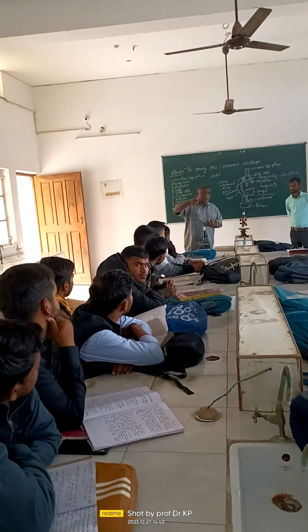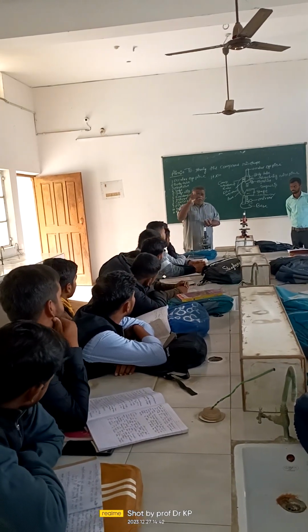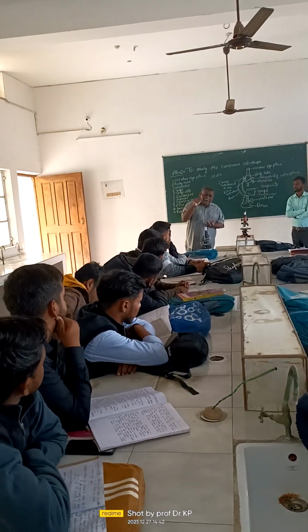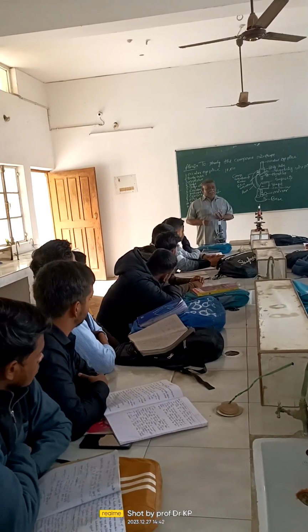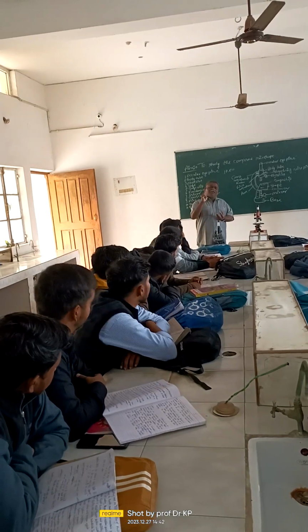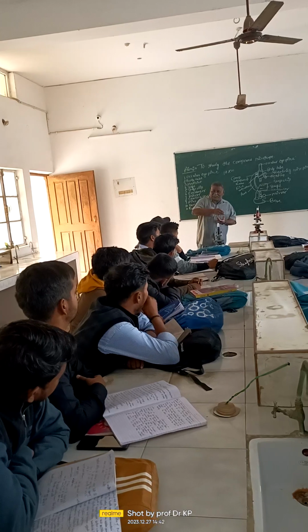Spatula, clear now? Everything is microscopic in nature. Spatulas are macro; that's for around 10 grams. You understand now? So the dissecting needle and the camel hair brush. It is made from camel hair. Okay? The camel hair brush can be used very well. Always try to have some kind of pattern in your hand as well as some blotting paper or normal filter paper in order to remove the excess liquid.